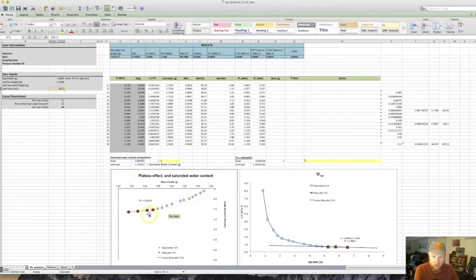In this curve, it extrapolates this line up to the y-intercept, where it equals 0, and gives you the saturated leaf weight. Generally, you want to start this curve with your leaf being saturated, but sometimes it doesn't happen even if you think it does. This is your saturated water content. So this is 17.4% of this leaf was water weight.